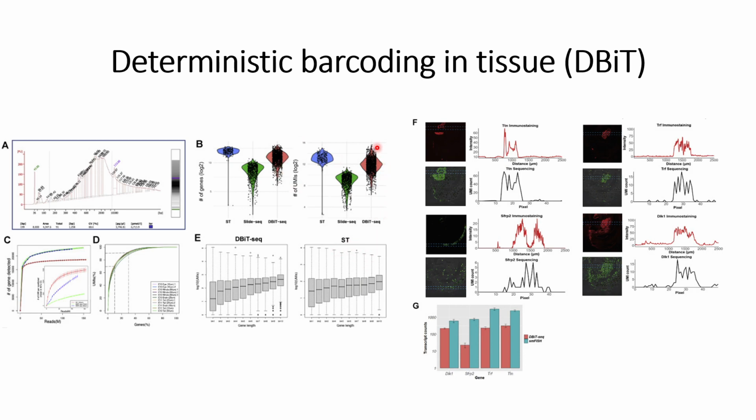So after comparing the results with other techniques, they also needed to check the results. They compared the results with immunostaining and their DBiT labeling.